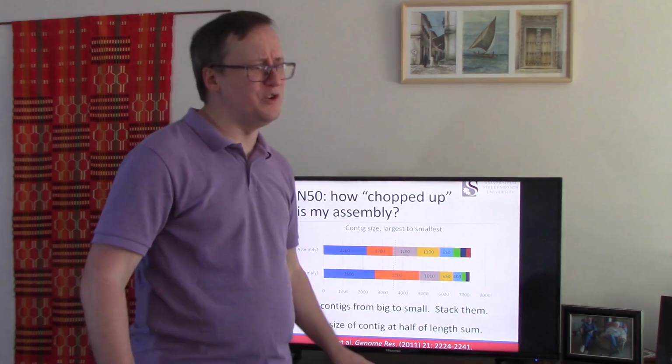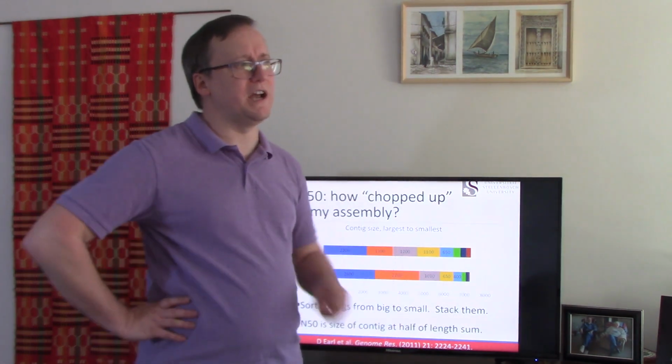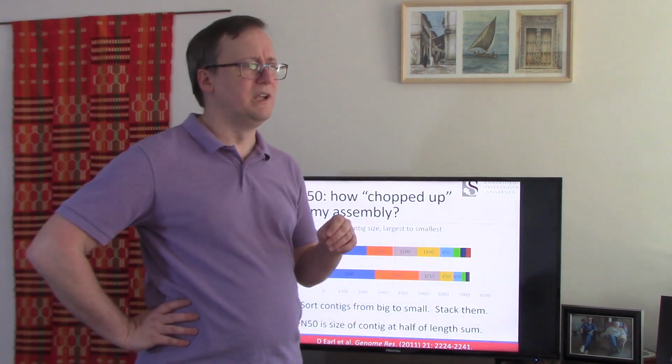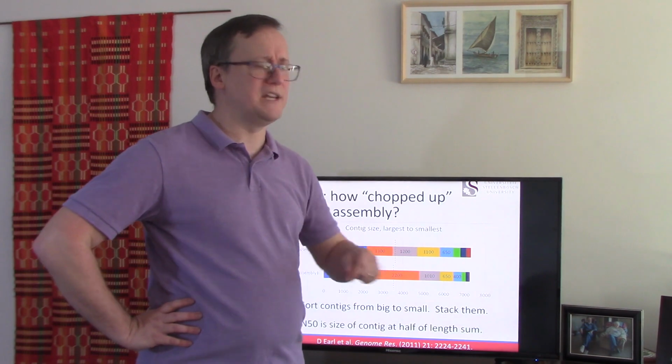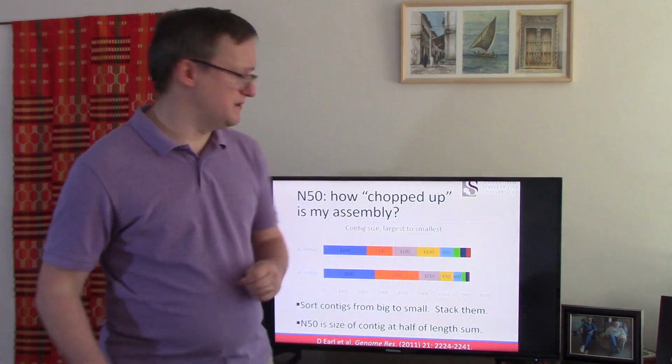So how do you know whether assembly has worked or not? You might think, well, this is great. I simply do a bunch of reads. Maybe I do 50 million reads for my sample. I do a de novo assembly from it, and out pops a chromosomal sequence. Sadly, it is not quite that clean by any stretch. Generally speaking, any de novo assembly process is going to generate some very large contigs, some very large scaffolds, and they're also going to produce some very small scaffolds. That is a messy problem.